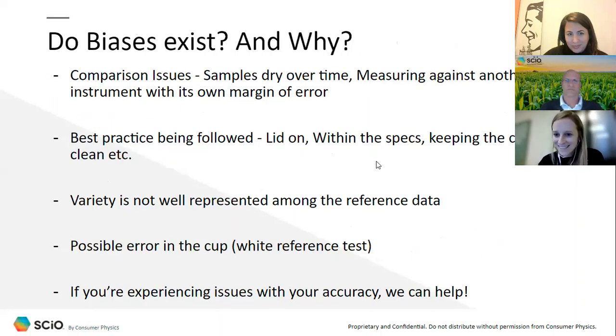All right, I think that's it. Oh, and bias. We get a lot of questions saying, why do I have a bias in my results? Now, there's a lot of reasons for there to be a bias.